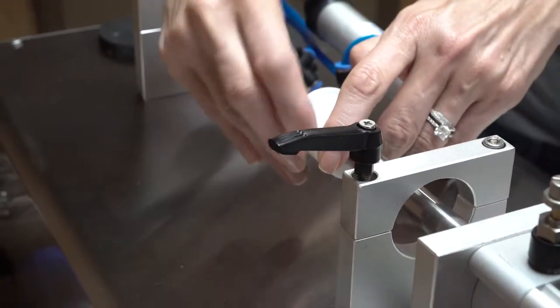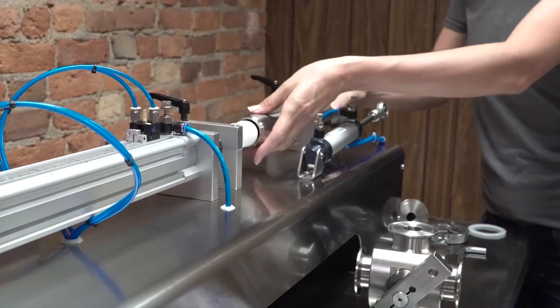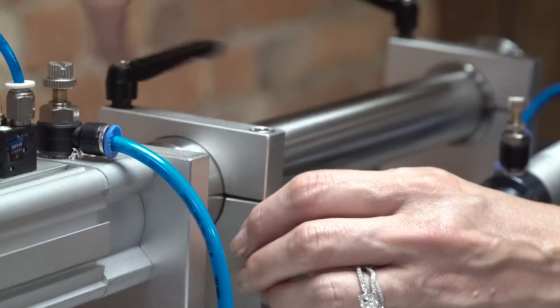Reinstall piston o-rings. Apply a small amount of lubricant to both o-rings. Install the product barrel. Tighten the black ratchet handles.